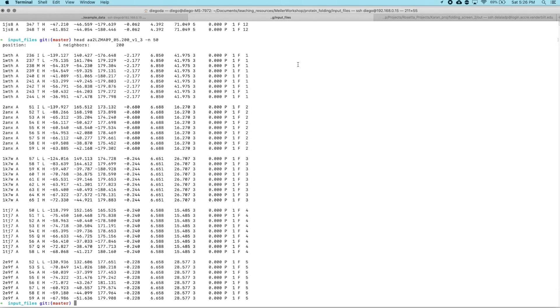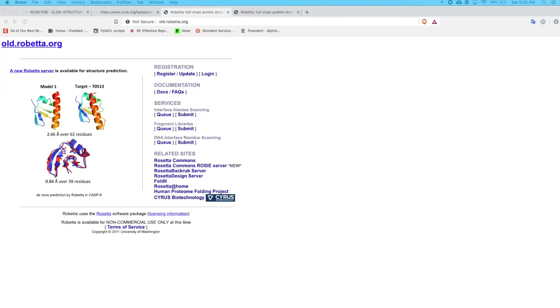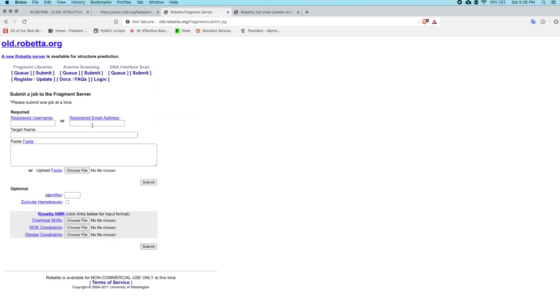I'm just going to go through the process of getting fragments using the Robetta server. This is something that's relatively easy to do and you can do it if you have an academic license. You just want to go to old.robetta.org and then go to fragment libraries, hit the submit button. You just provide your email address, the target name, and then the FASTA sequence for your protein. If you're doing benchmarking, one thing I would like to stress is that this is going to pull fragments from a database of proteins. And if you know the structure of your protein, probably your protein is part of that database, so you're going to be cheating if you generate fragments from the actual experimental structure of the protein you're trying to predict. To avoid that, you just check the box to exclude homologs and provide the PDB identifier. Then you just hit submit and it'll email you when the job is done.